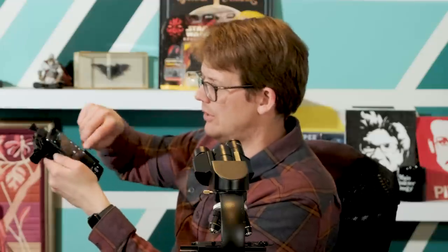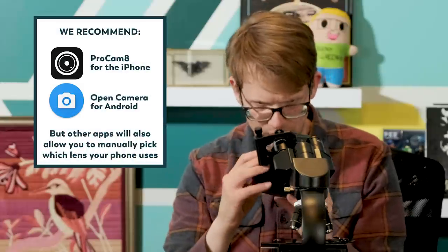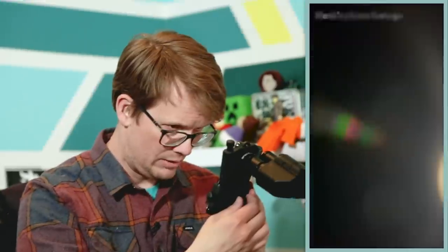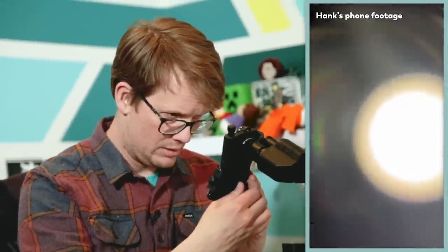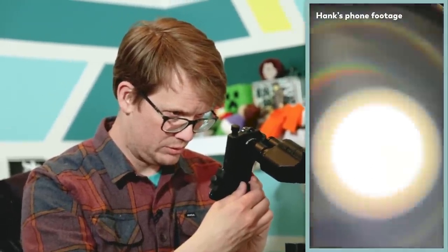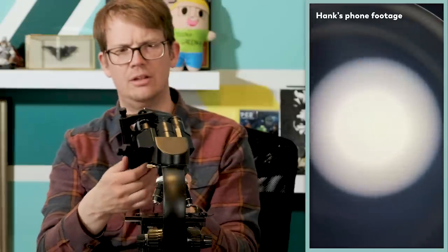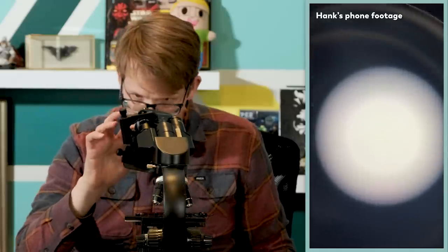With my big phone, I have to clamp low down so I can get the lens up to where the hole is. I'm going to slide that on there. I've got to make sure I'm set to my double lens — my 2X. I use ProCam to do this, because otherwise Apple will mess with you since it's trying to fix everything. Now I've got my little circle right in the middle, I'm going to clamp it — there it is. Beautiful. And then I'm going to zoom in.